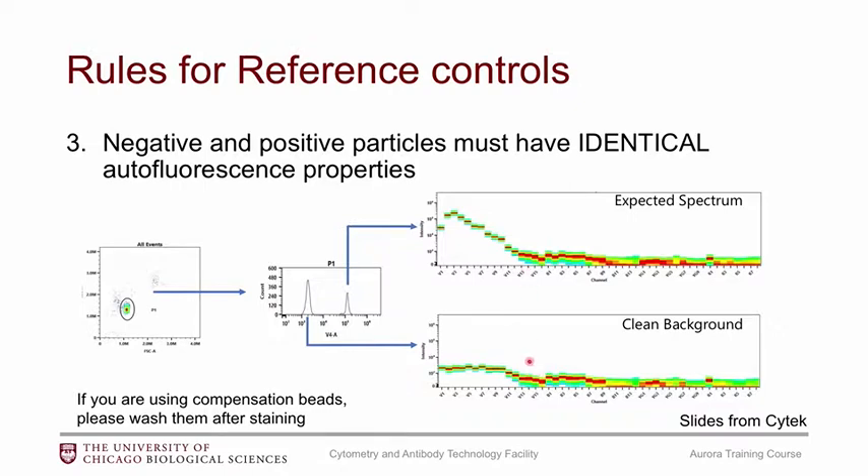If your autofluorescence properties are different, the algorithm will subtract out a signal that isn't in the positive signature, making your reference control inaccurate. Also, if you're using compensation beads, make sure to wash them — excess antibodies can stick to negative beads and appear in the background. You want your negative population to have a clean autofluorescence background with no signal similar to your positive population. Check an unstained sample to see what the expected autofluorescence signature should look like.